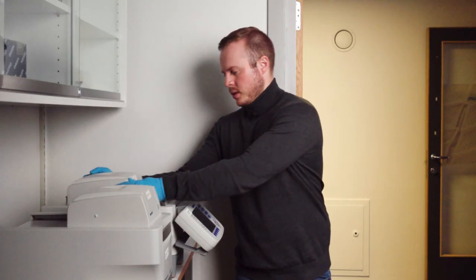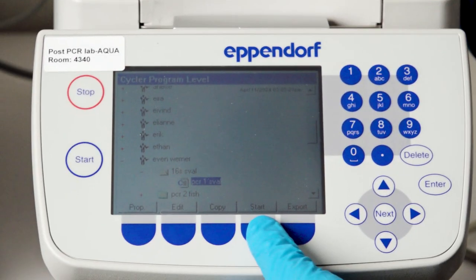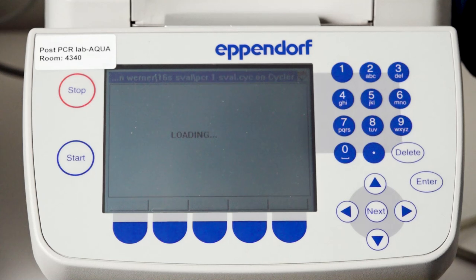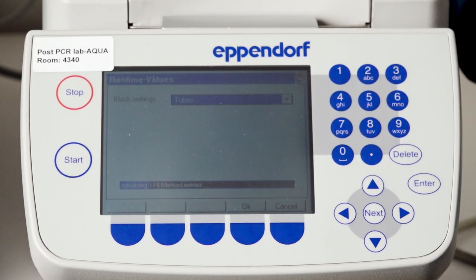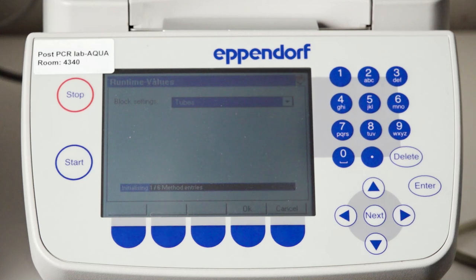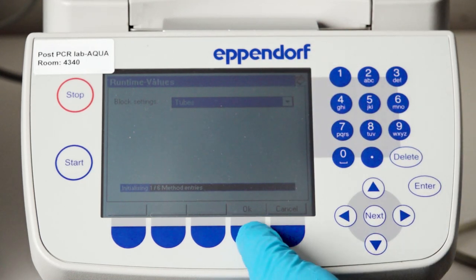After we have done that we close the machine and then we push the start button. Then it says loading program. Since we are running tubes and not a plate in this instance, we need to select tubes and say okay.